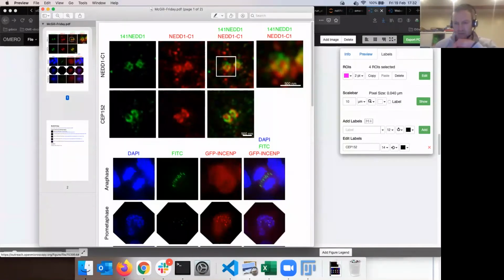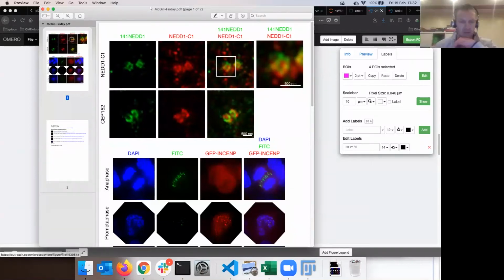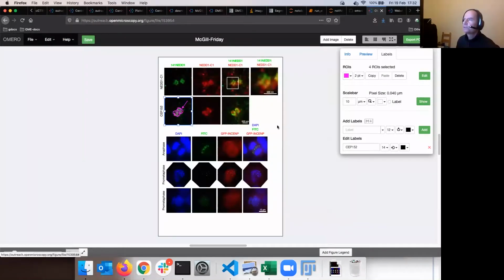Can letters be added to the figure? So where do you want to add letters to the figure? Like A, B, and C as an annotation? Yeah, like panel numbers. Yeah, they would be as a label. Peter, maybe you can, principally that shouldn't be a problem.